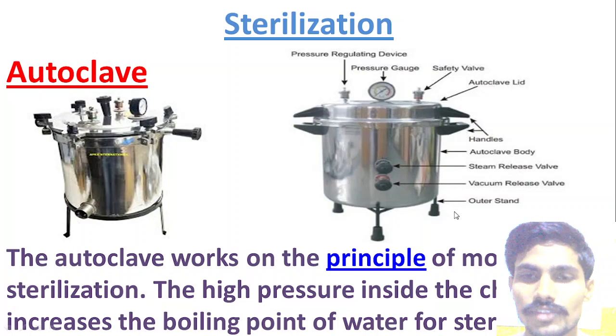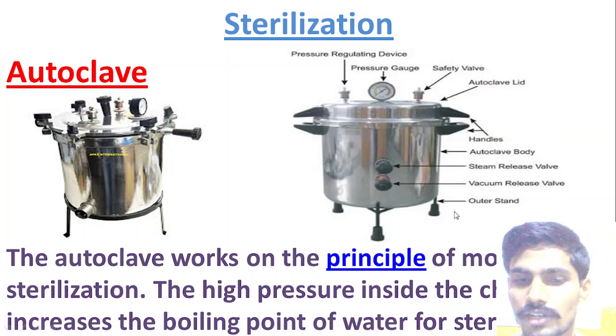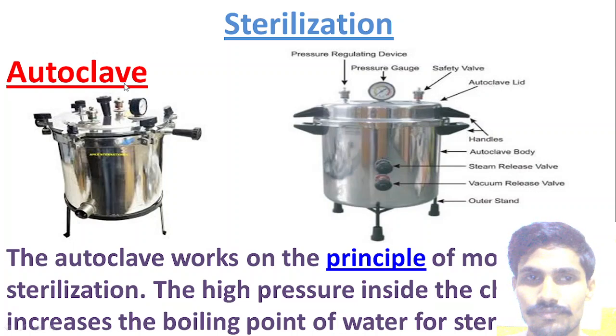Friends, today I will explain one of the important concepts, that is autoclave, that comes under the chapter sterilization. Already I have given two videos on this sterilization chapter. This is the third video, part 3, that is autoclave.